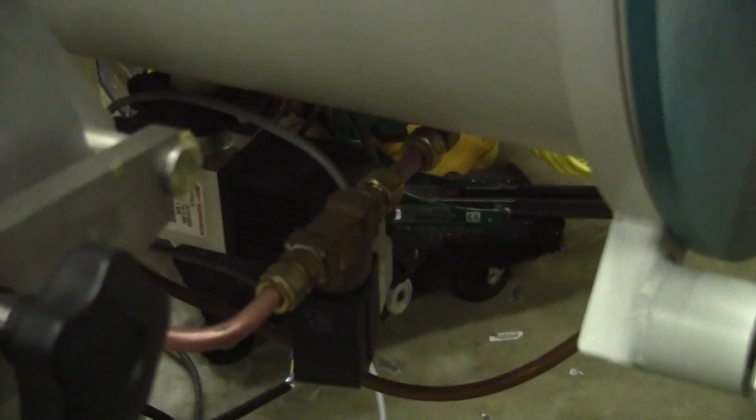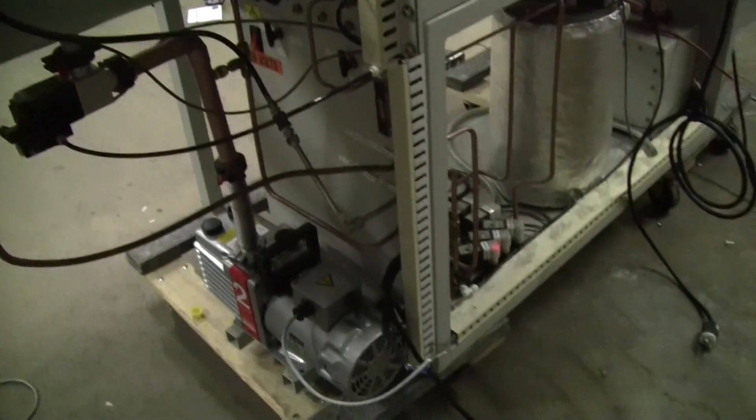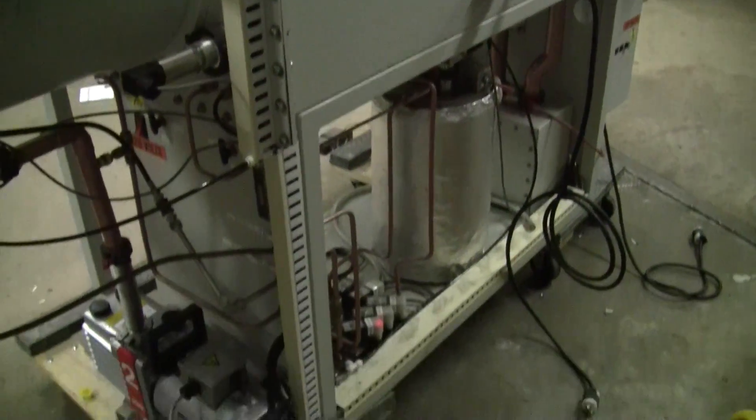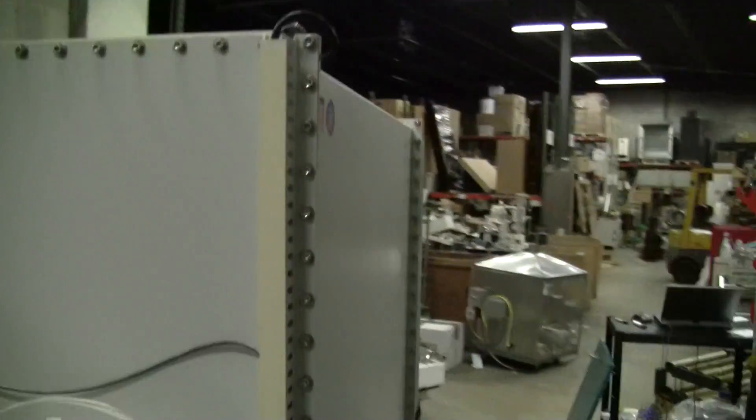You can hear the vacuum pump running. Take a look at the rear of the unit. This unit is not on wheels. The refrigeration system also works.